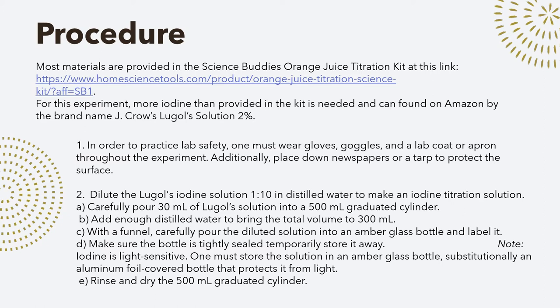After I was all safetied up, I poured 30 milliliters of the solution in a 500 milliliter graduated cylinder and added enough water to bring the total volume up to 300 milliliters. Once I had that solution, I put it in glass bottles and labeled it. It is light sensitive, so it is important to put it in a dark place or in a dark bottle.